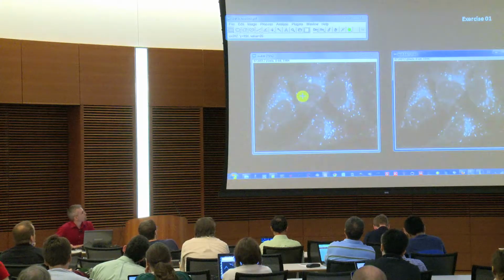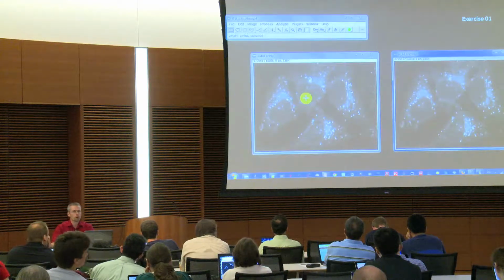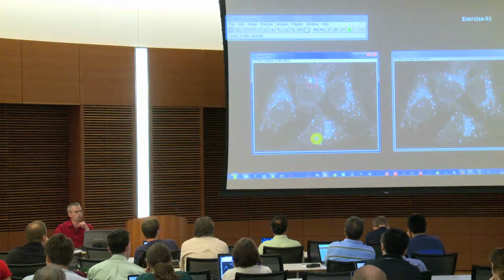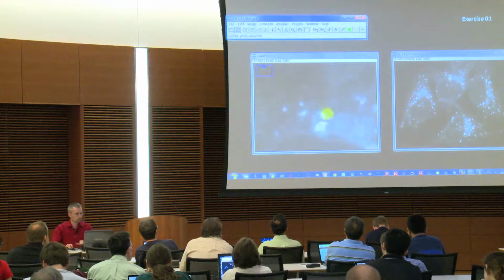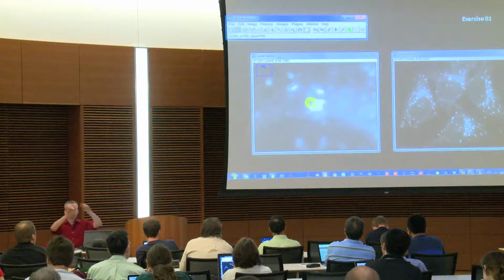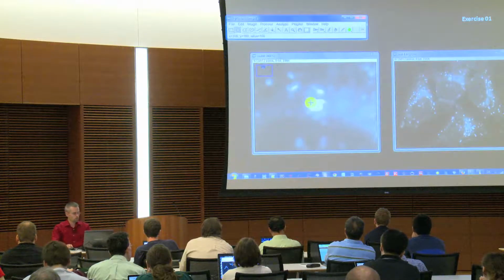As mentioned, if I want to work out those spots clearer, the biggest spot is up here, this part. To estimate the diameter of that, I would normally use a roundish tool. Zoom in a little bit, and then create a perfect circle around that object and get the diameter from the circle.